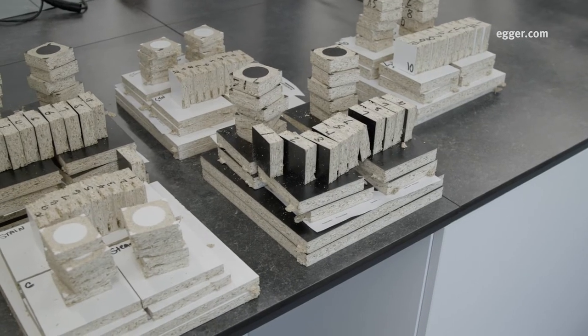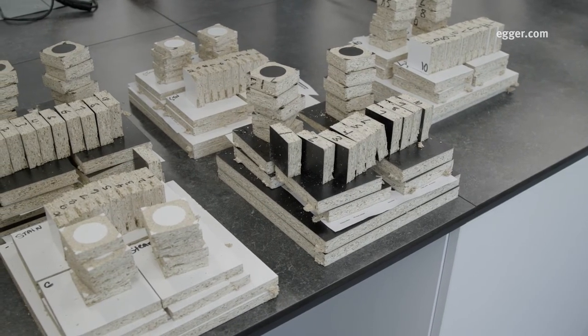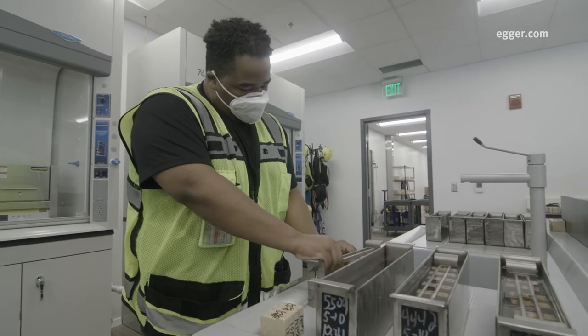If a sample doesn't meet our own or any external standards, the boards are quarantined, inspected, and retested.